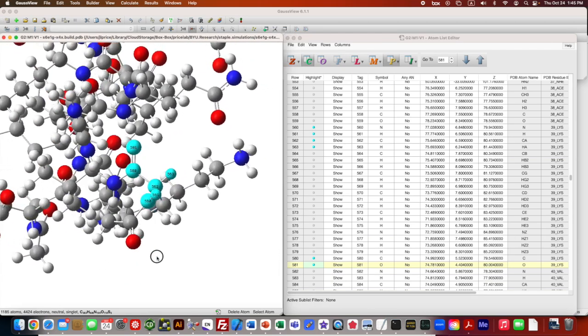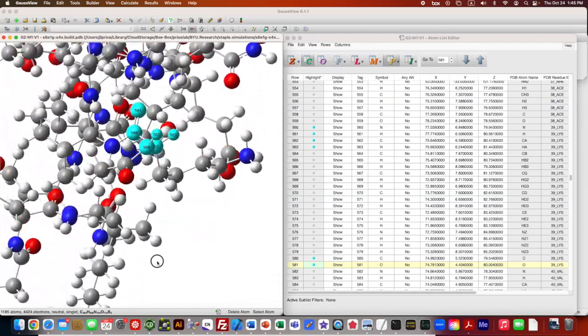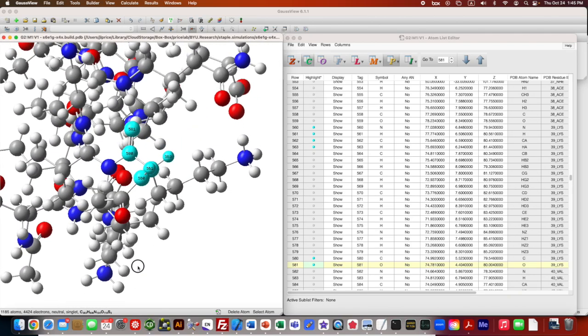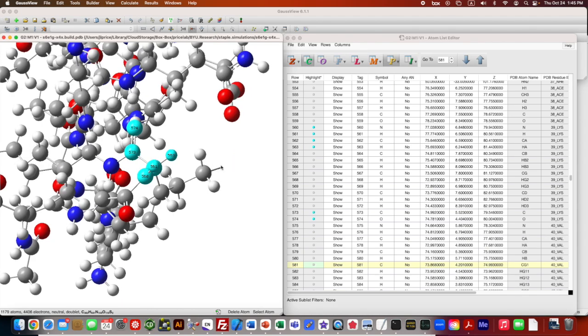Okay, so I'm just going to delete everything in that side chain that's not highlighted. I'm going to try to get a clean shot so I don't accidentally delete things that I shouldn't. And we're still on the red X, so oops. Sometimes if you delete carbons, it will delete everything that's attached to the carbon, which is nice, but also scary.